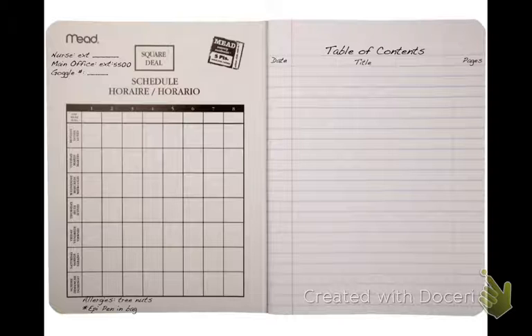So open up to the next page. The left-hand side I want you to keep blank. That's going to be for the back of the table of contents, because you might go over to the next page as well. On the right-hand side, that's where we're going to start our first entry. So it'll probably end up being lab safety. Make sure you put that title in there. Write down whatever the date is, today's date.